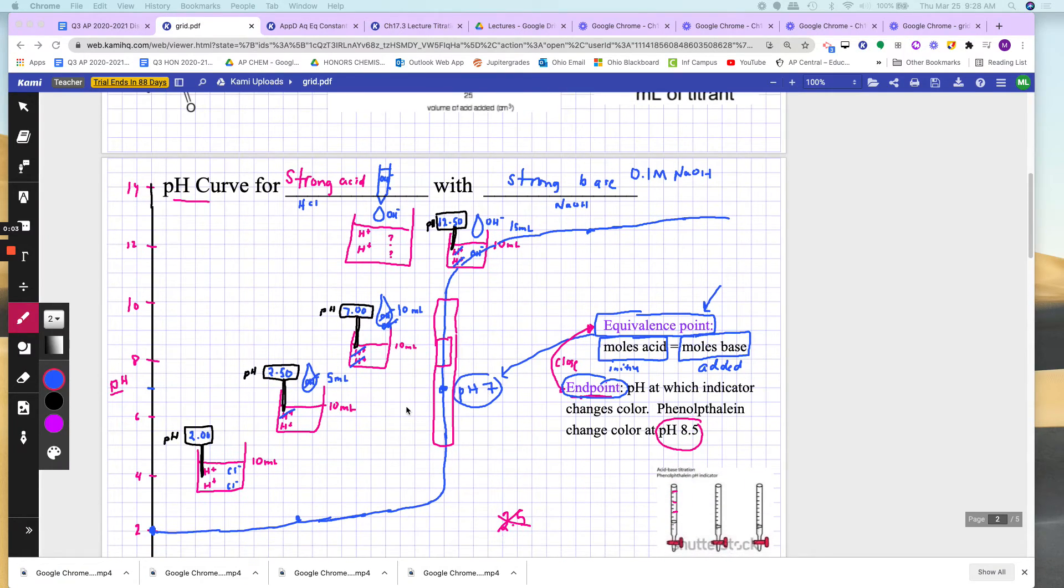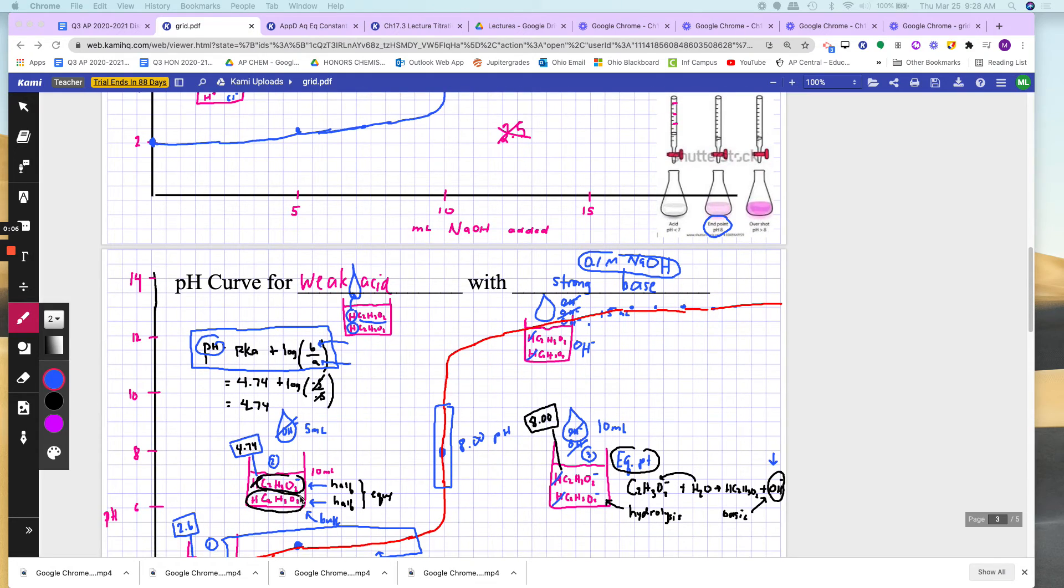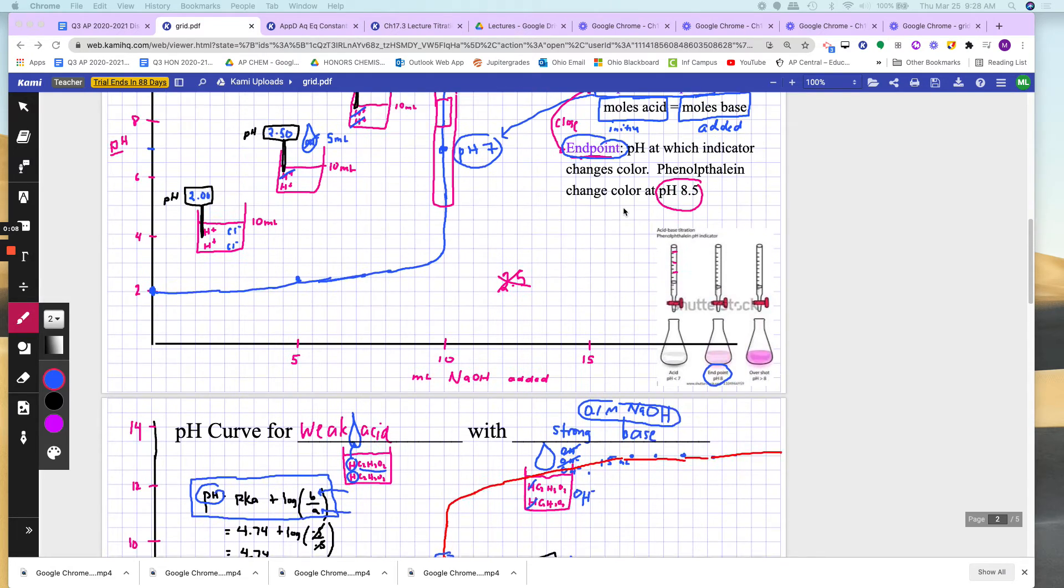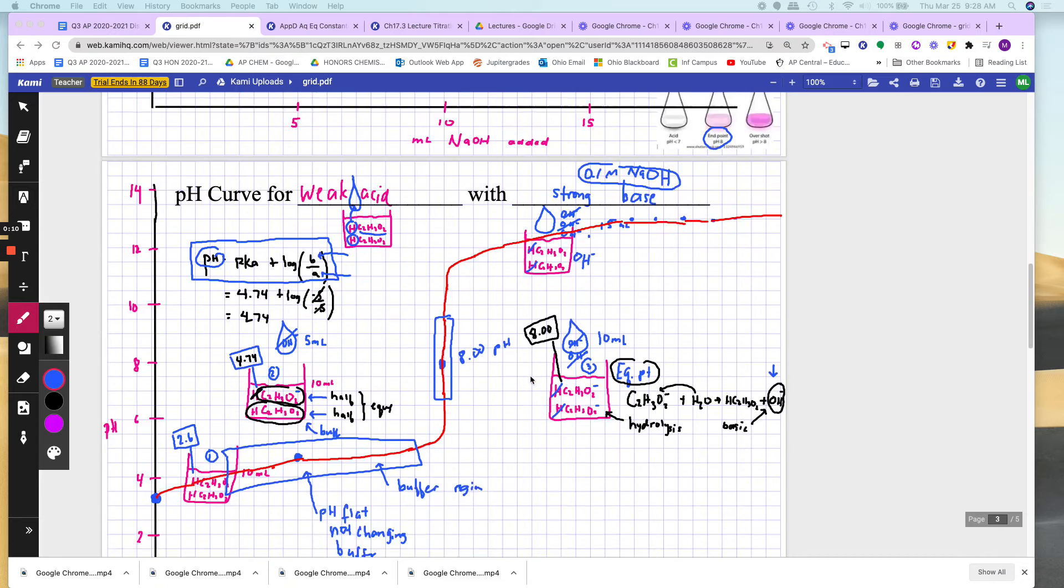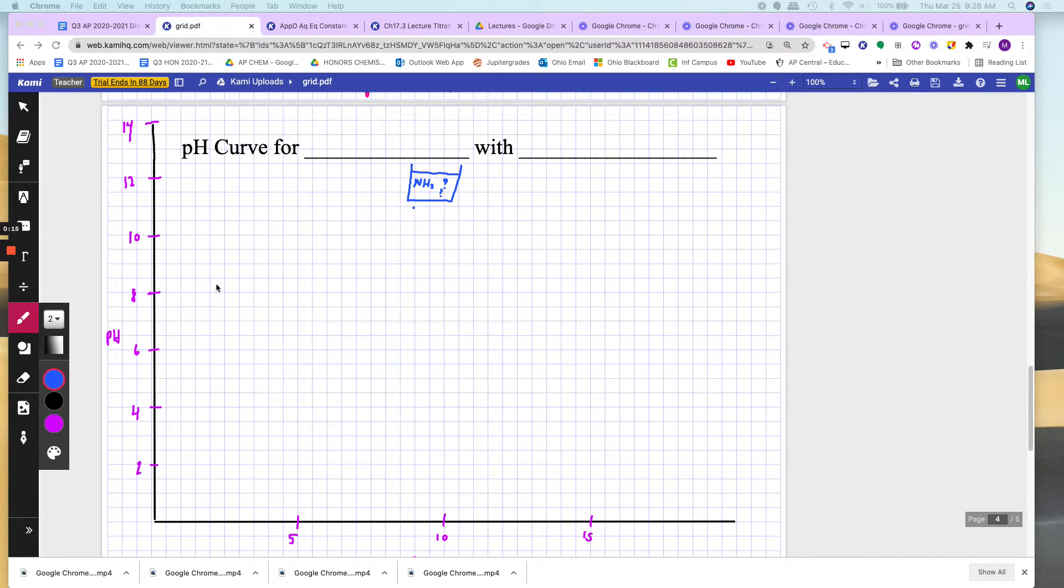For both of the titrations we've done so far, you have strong acid and a weak acid. You're titrating them, both of them with strong bases. Let's do a third one. What do you think will go in the beaker now? What are the other choices? Yeah, why don't we try a weak base now? So we're going to try a weak base.